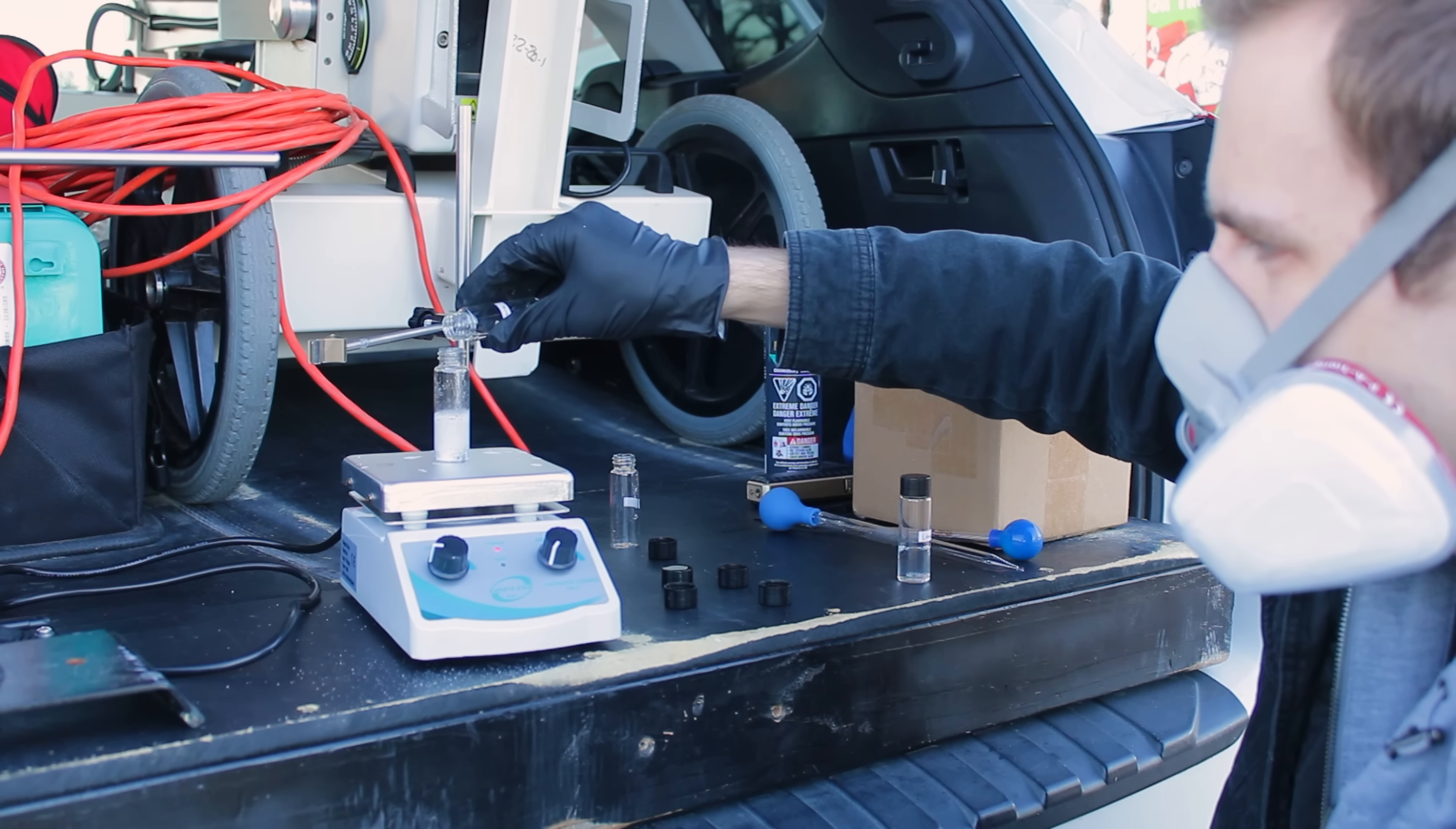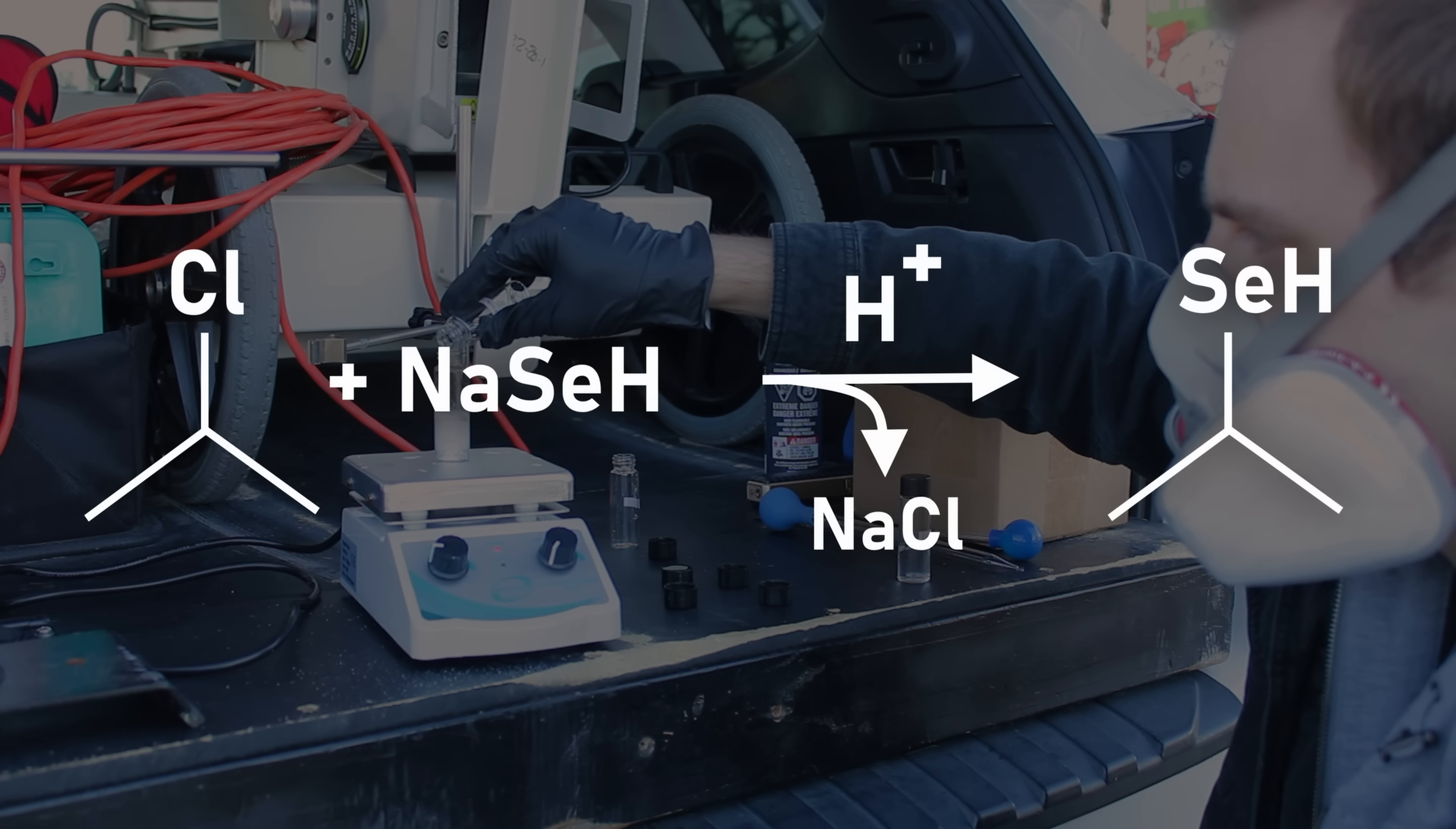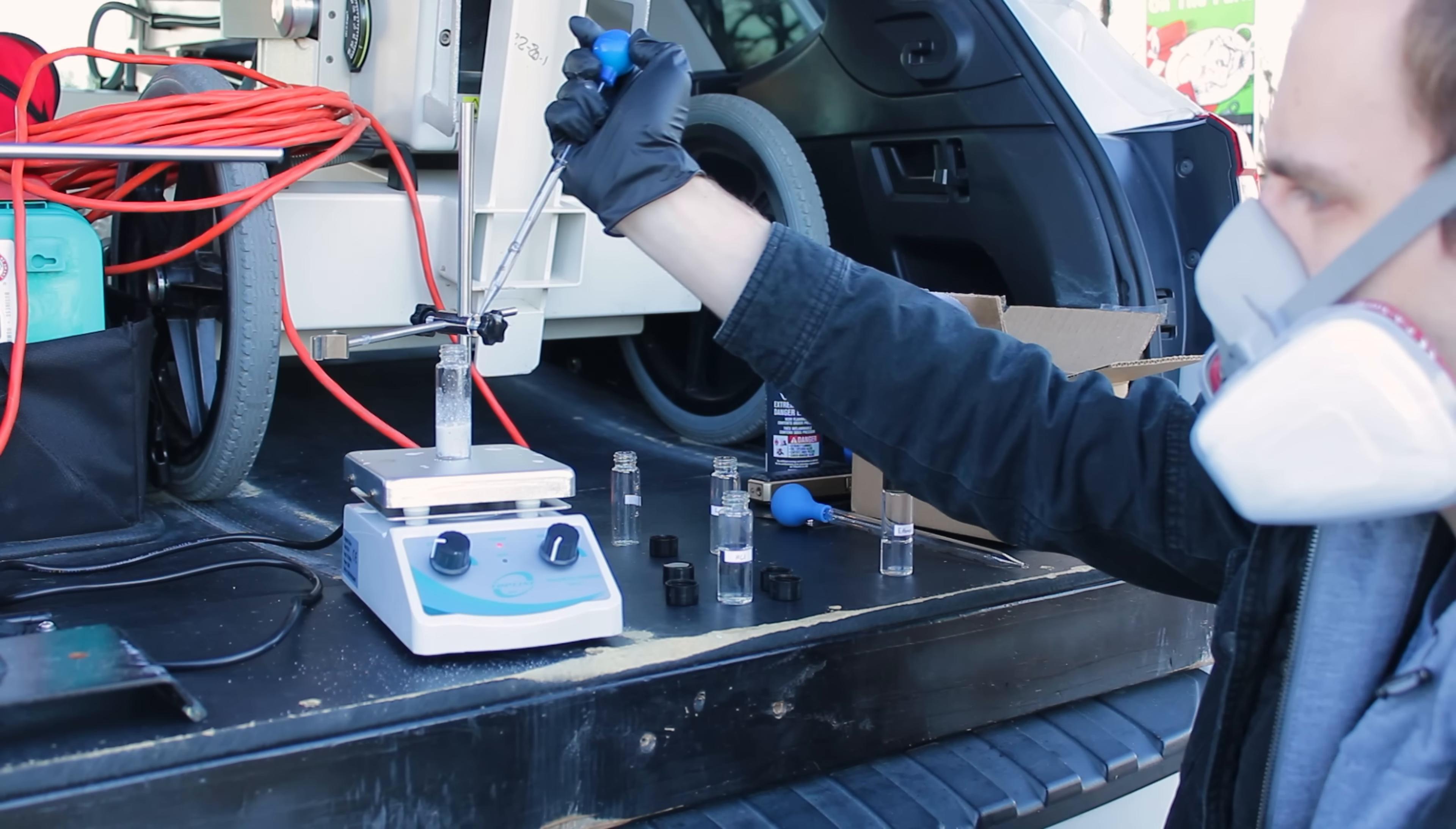Anyway, once the reaction calmed down, 1.3 grams of isopropyl chloride was added to the mixture, followed by 1.6 milliliters of 30% hydrochloric acid. The authors didn't talk much about this part of the reaction, but from what I can tell, it's basically an acid-catalyzed double displacement that swaps the halide on the alkyl group for the hydroselenide portion of the sodium hydroselenide, forming the final selenol. Whatever the case, it seemed to work just fine.